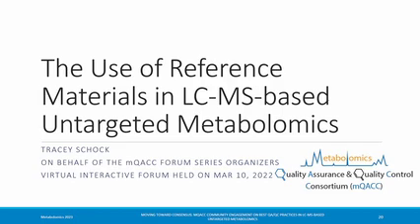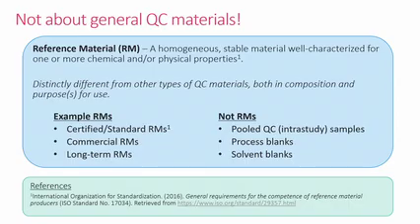Okay, good morning, everyone. So this is an exciting topic. We'll talk about our use of reference materials in LCMS-based metabolomics, untargeted metabolomics. So our forum was in March of 2022. And to set the topic, we are not talking about general quality control materials. We're talking about a reference material.